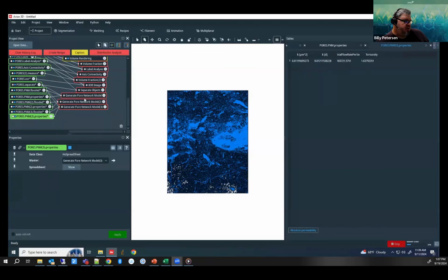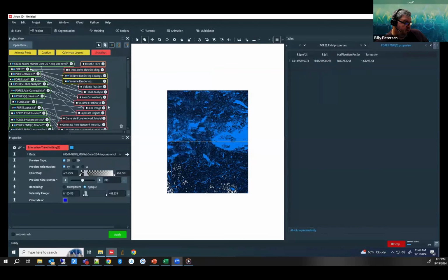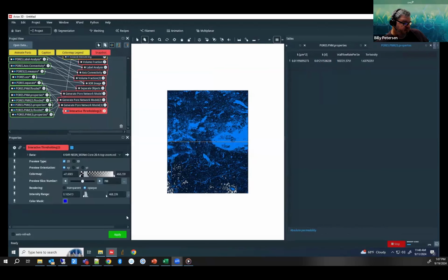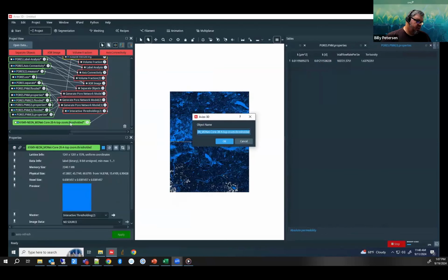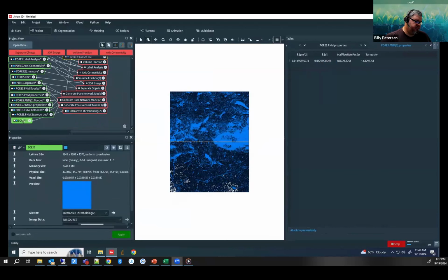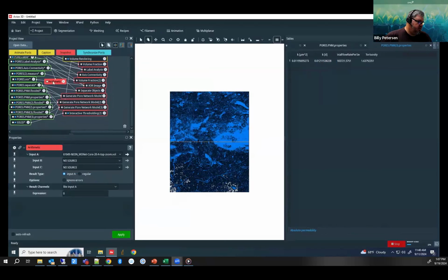Okay, from here, we're going to start our analysis on the solid material. So we threshold the solid material, which is basically the minimum and maximum of the thresholding that the scan already did, which is easy, boom, done. From there, we apply arithmetic to the entire core.